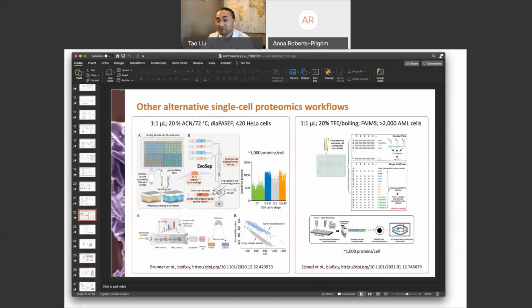Yeah, I wouldn't say it's impossible. We can try, certainly, but again, the key is the upfront sample manipulation, as alluded to in the first couple of slides. In terms of mass spec sensitivity, you can achieve very high sensitivity detection, as long as your target proteins don't get lost during the sample process. There's a chance. The other way to do this is to run it in a targeted mode. We are also doing some of this targeted single-cell work. We have demonstrated that for some targets, for example in the EGFR pathway, we can analyze them at a very high level of sensitivity, including some of these phosphorylation events.